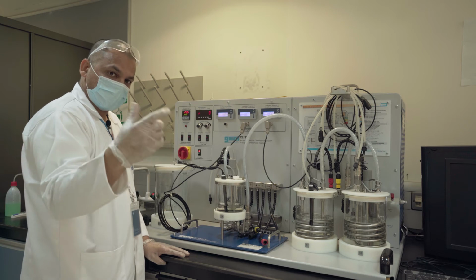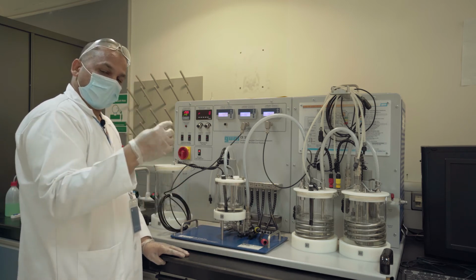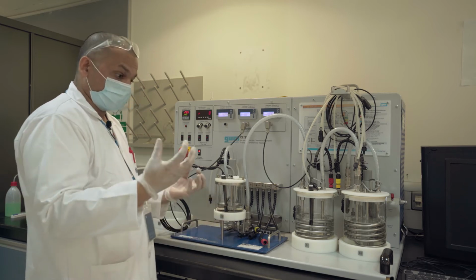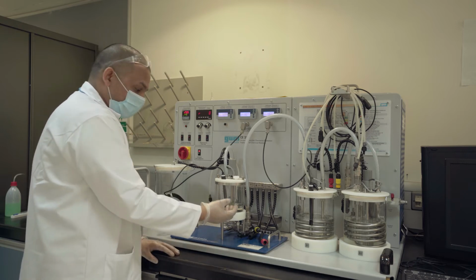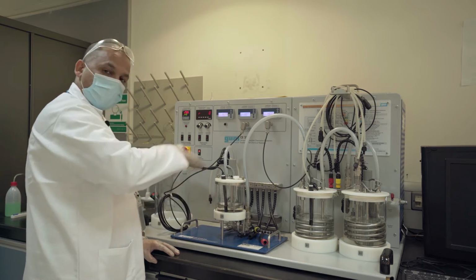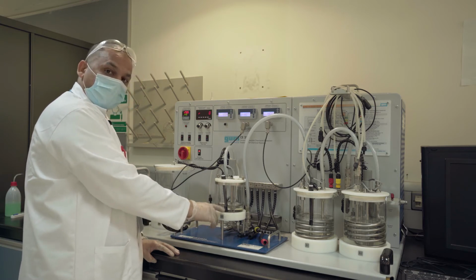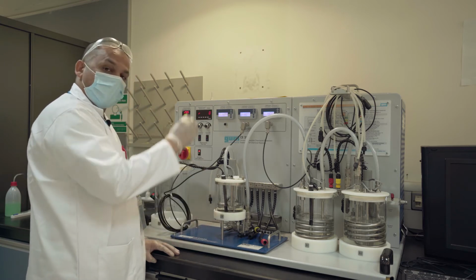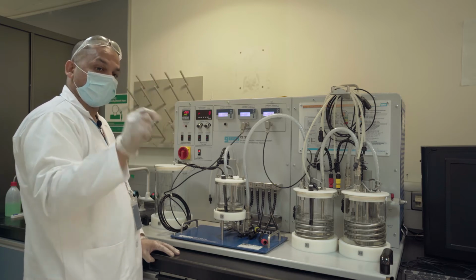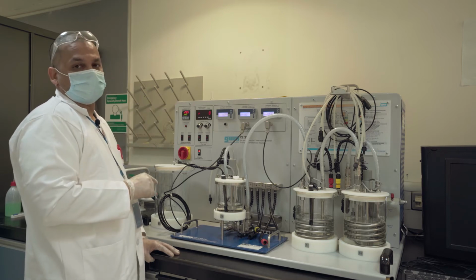The other unknowns, the activation energy and the rate constant, I can also find by working at different temperatures. So I take the equimolar feed again and do it at 25 degrees C and find the plot to get the slope. Then I do another one at a different temperature, and another at three different temperatures, find the final conductivity, and then plot it and get the slope. So this slope will basically give me the activation energy, and the intercept will give me the A naught.